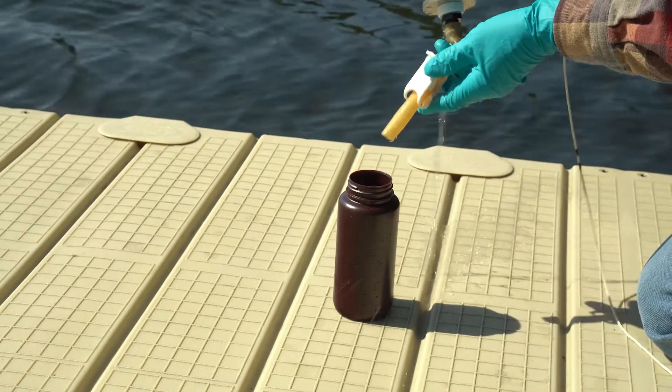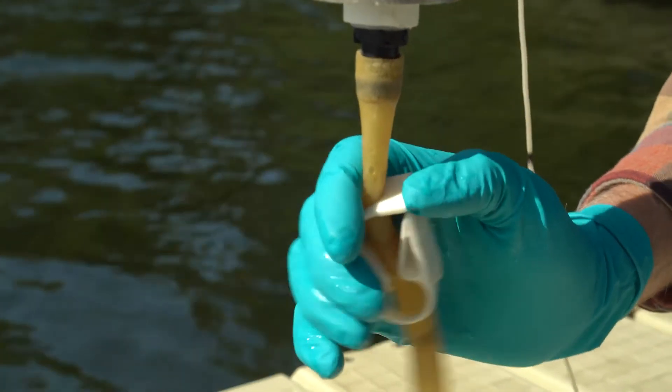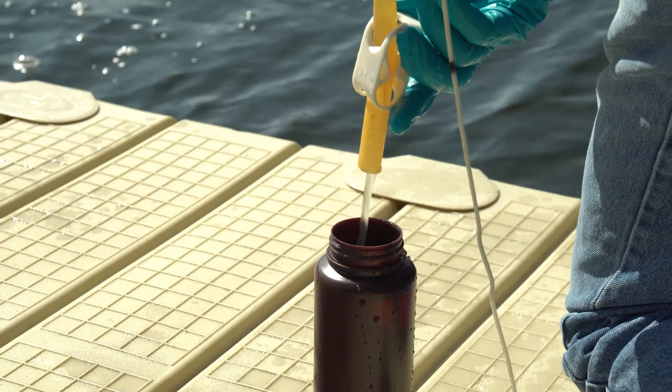Place the tube over your prepared sample bottle and disengage the clip, allowing the water and collected materials to drain from the net and into the sample bottle.